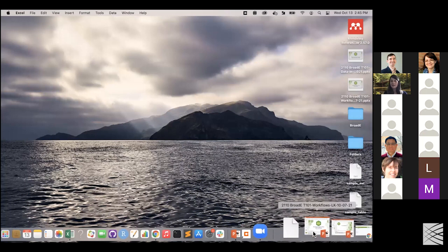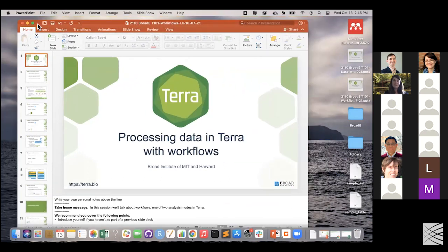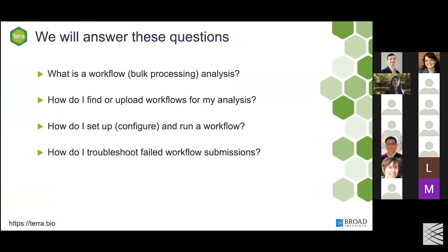All right, I'm going to go ahead and dive into workflows, and then we're going to do some more hands-on activities. So we're going to talk about data processing in Terra with workflows. Specifically, we're going to hopefully answer today, what is a workflow analysis? You've gotten a flavor for it in our last section, but we're going to talk in more detail about what workflows are, how you find and upload workflows for your analysis, how you can configure them to run a workflow, and how you can troubleshoot failed workflow submissions.